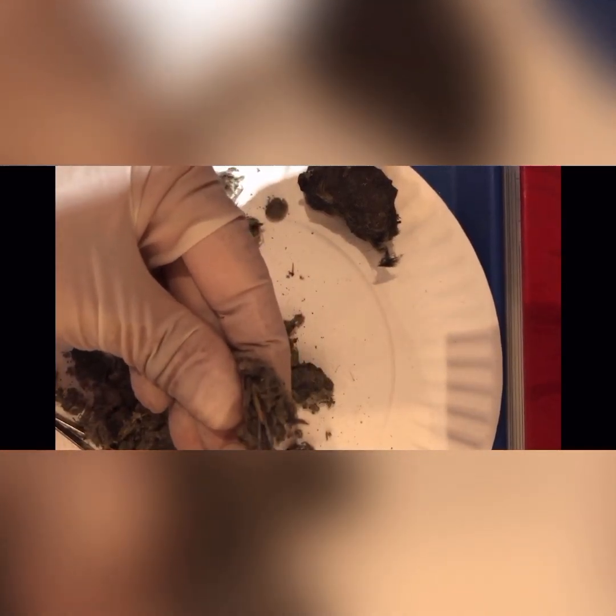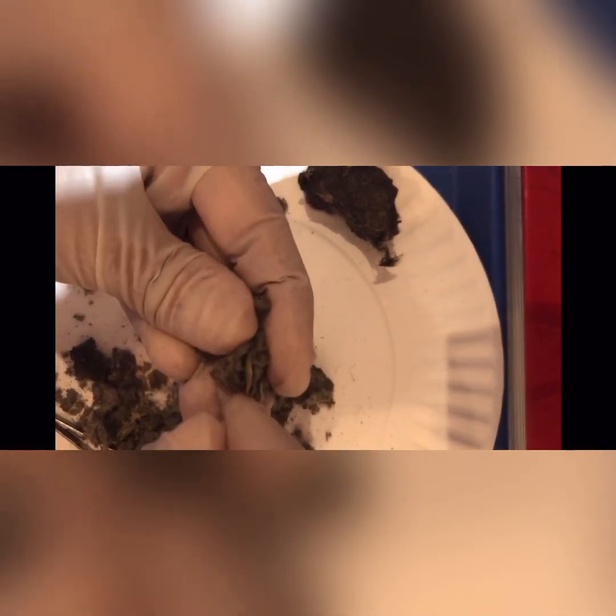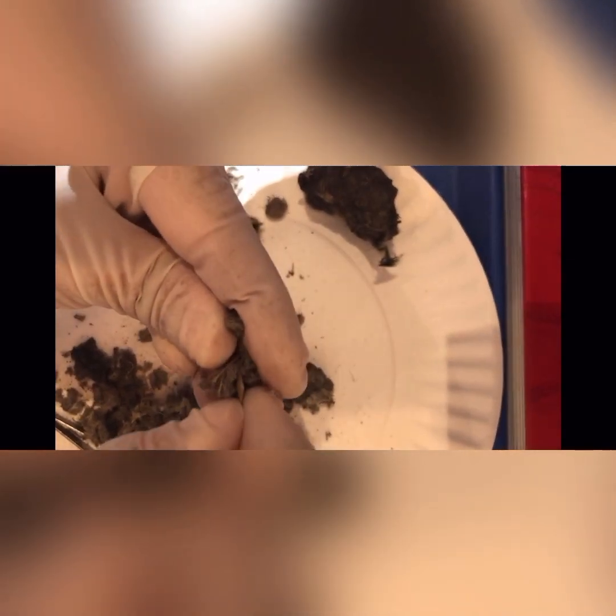Oh, look what I found, another jaw. So you wanna find at least 2 jaws, right? You have 1 skull, 2 jaws.